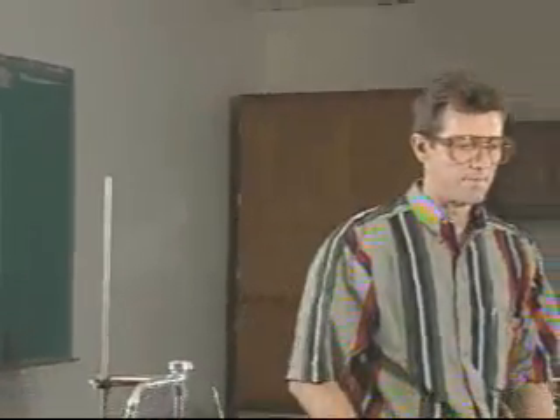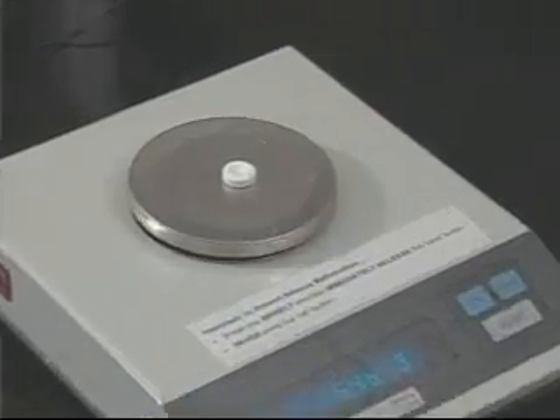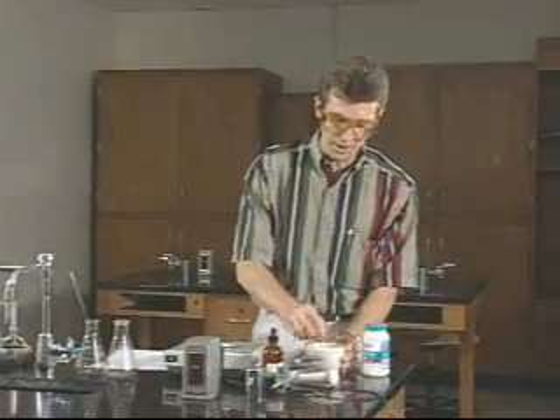So to begin today's experiment, we have been assigned an antacid tablet. The first thing we need to do is get a weight of the whole tablet. We'll place it on a balance, as we have done many times, and record the mass on the report sheet — about 75% of the way down the report sheet there will be a place for the mass of the whole tablet. We then need to grind the tablet, so we'll put it in a mortar and tap on it with a pestle to get it broken up, and finally give it the circular grinding motion until it becomes a nice powder.